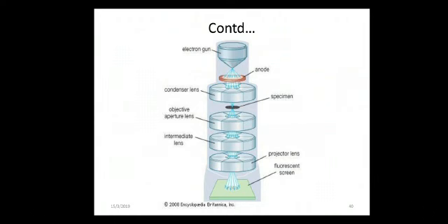It offers more powerful magnifications, potentially over a million times more than the actual image, provides information on elemental and compound structures, and is also used to get high quality images for detailed analysis. It provides information about morphological structures, crystallinity, particle size distribution and elemental composition of the sample.